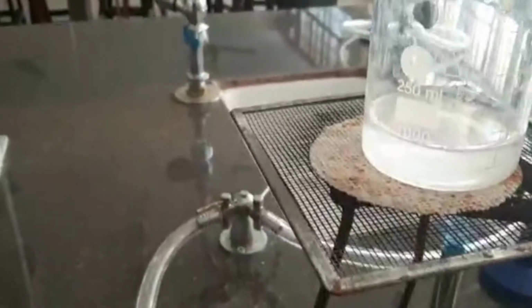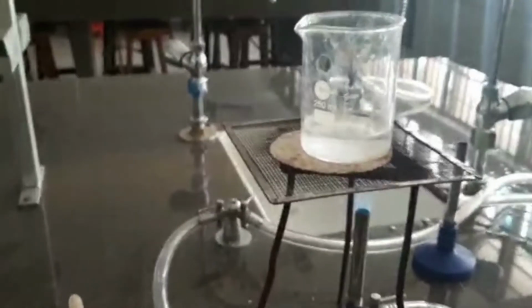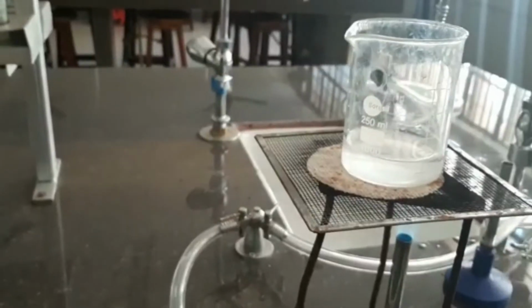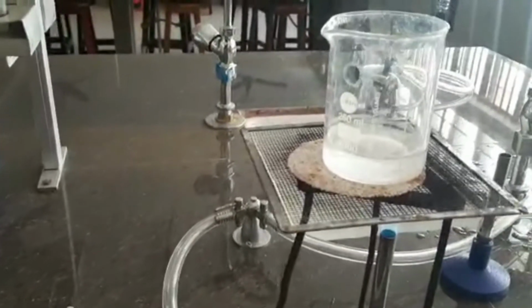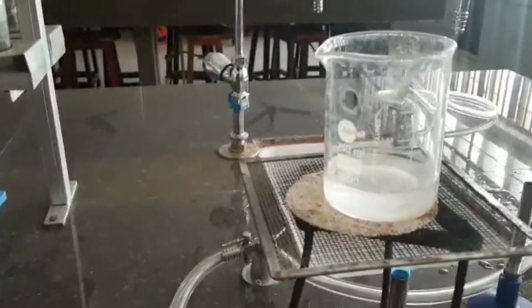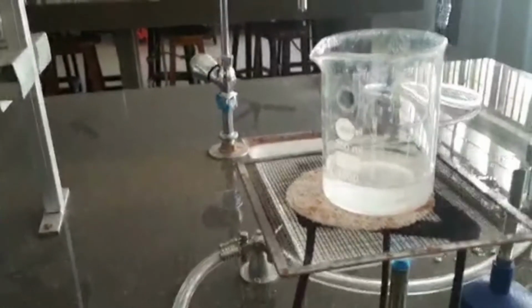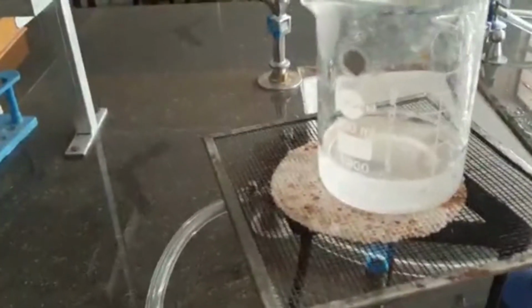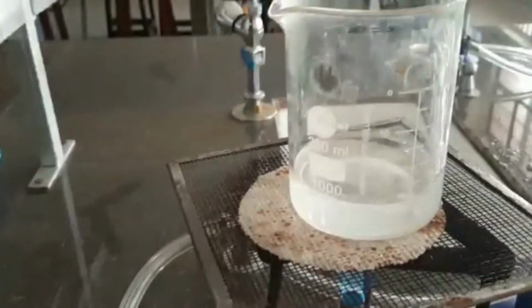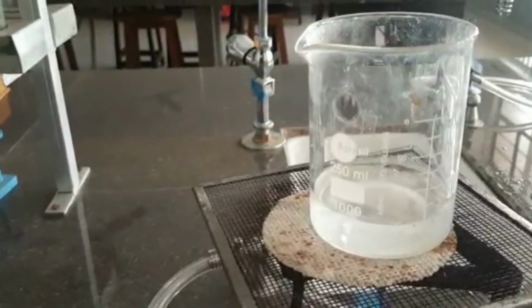50 ml of water has been kept for boiling. So the purpose of using boiling water is to remove any dissolved oxygen. So in case oxygen is dissolved in water, it will have a tendency to oxidize ferrous sulfate to ferric sulfate. So we are going to boil off this water to remove any dissolved oxygen. So this boiling water we are going to use for making solution.